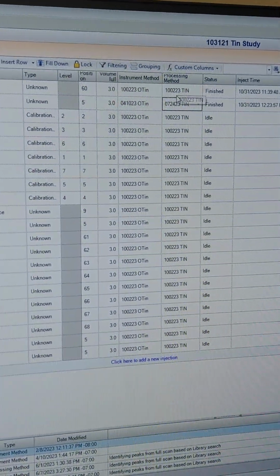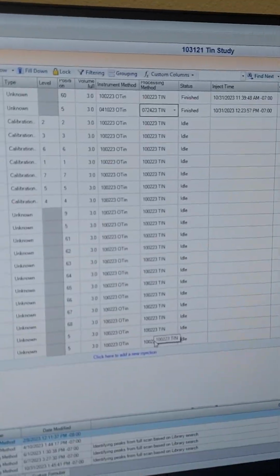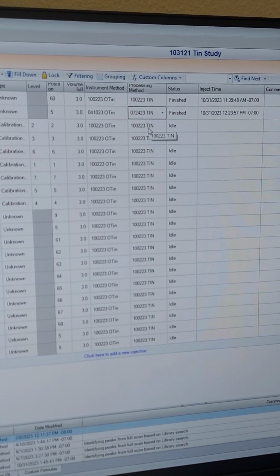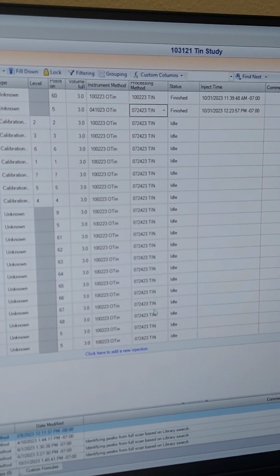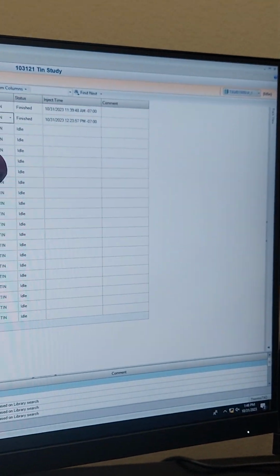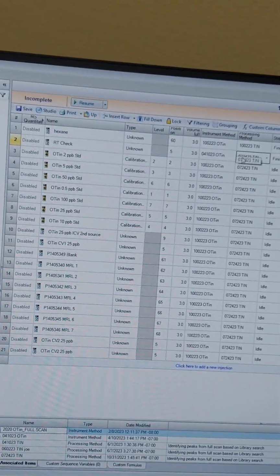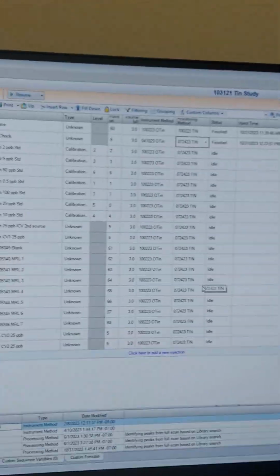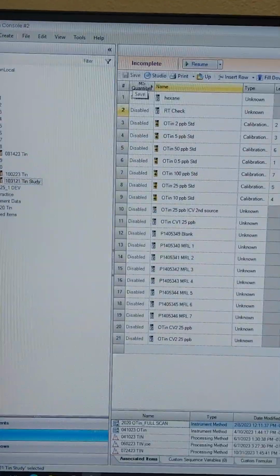So now we updated this processing method, and that's pretty much what we want to process all these with. Because those are different methods to this one, right? Yeah, we just fixed the time for this one, not for the other. But now it's all the same. So let's do that.